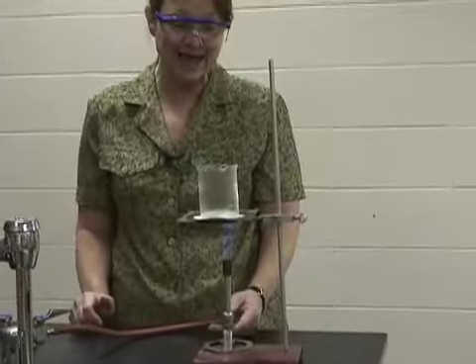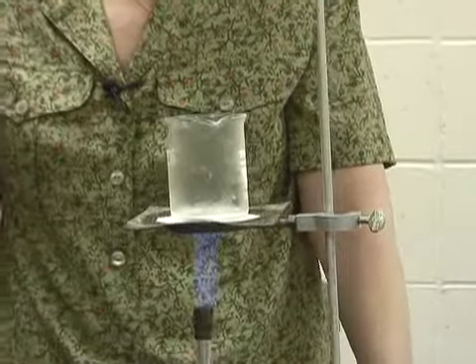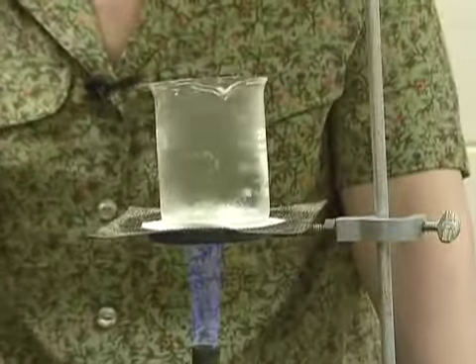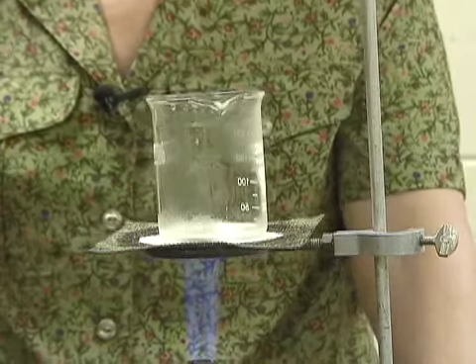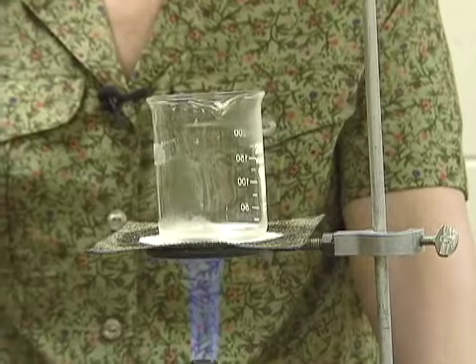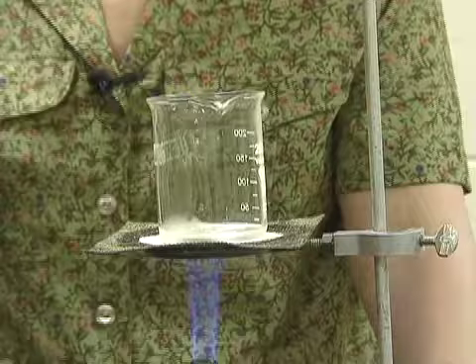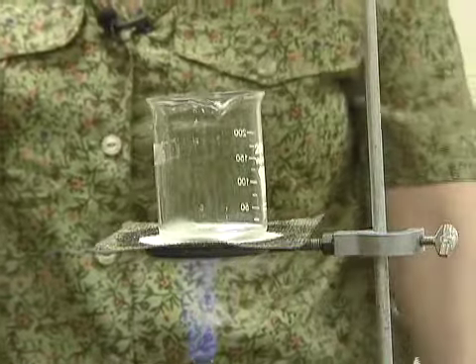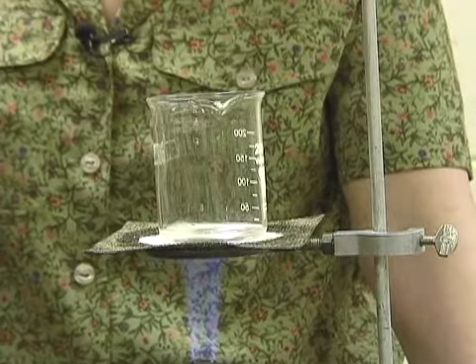Wow, look at that. Heating up that liquid. It's beginning to evaporate, and it hits the sides of the beaker. And as it hits the sides of the beaker, it cools down quickly and condenses. Now, again, we're going to have patience as we watch and wait for the liquid to totally evaporate off. We want that liquid gone.